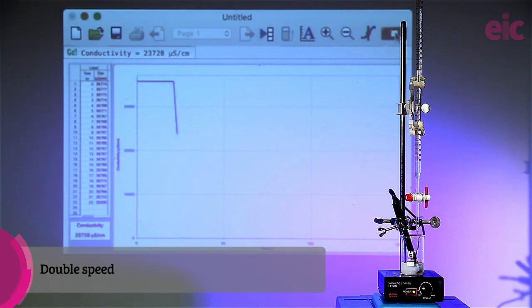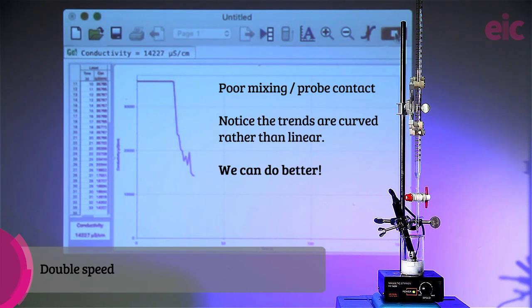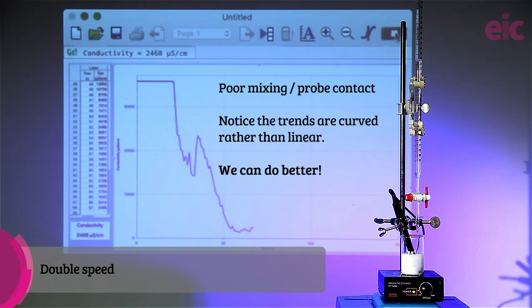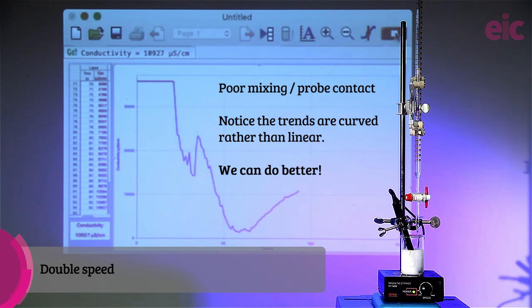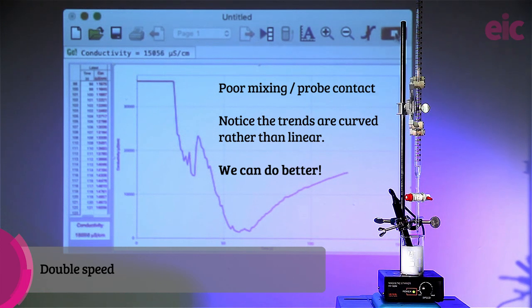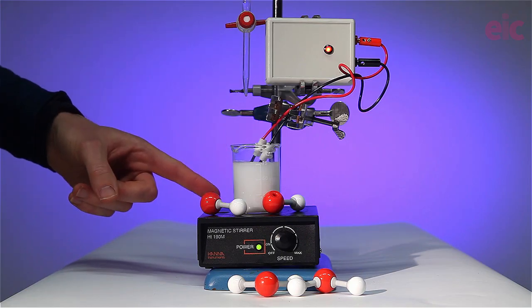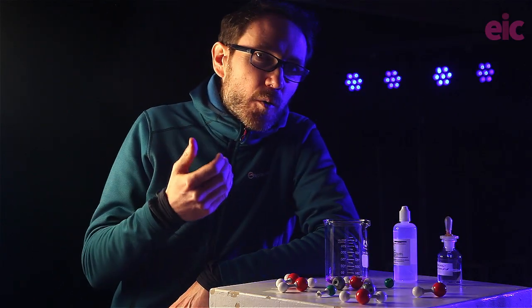A tenfold dilution will largely fix this issue. We do get a broadly V-shaped graph, but notice the way it curves — we're diluting the solution so that at the endpoint the ion concentration has actually dropped threefold. This isn't a problem when generating pH curves because the logarithmic nature compresses most of the dilution effect. The minimum also lags after addition of the equimolar quantity of reactants, due to poor mixing and the time taken for precipitation to complete. It would be better to have more volume to play with, and electrode submersion depth also varies.